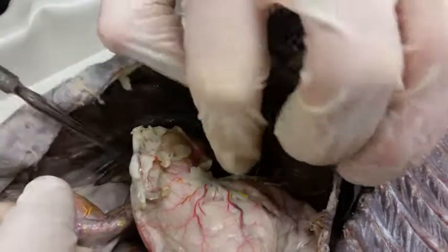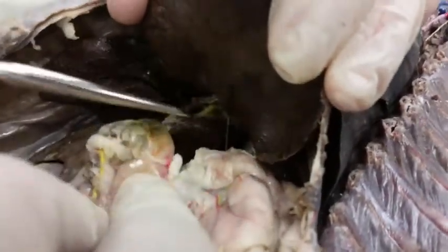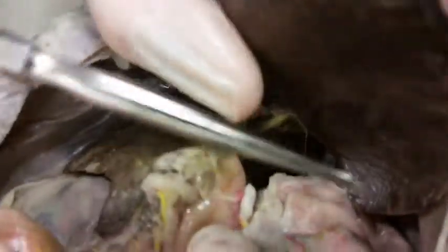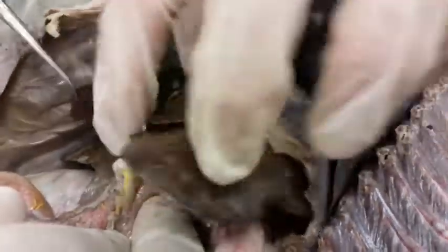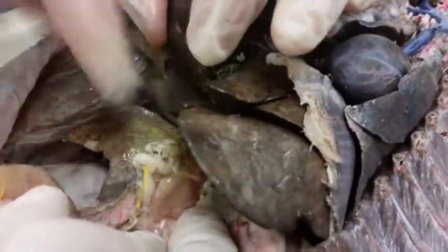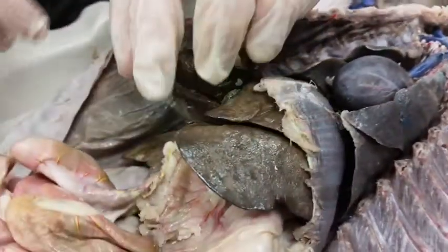Or wait, actually this is caudate, part of caudate. Sorry, okay, we're gonna go from left to right here. We have caudate back here, caudate lobe, light really sucks. Okay, caudate lobe, left lateral, left medial, quadrate, right medial, right lateral, other part of the caudate. Alright.